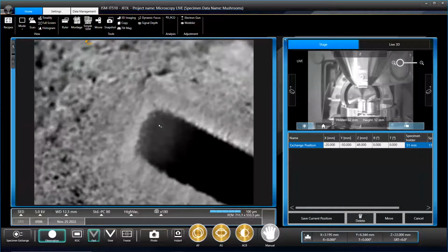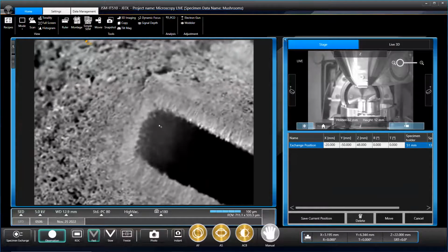Will that begin to focus? You're using the focus dial at the moment. If you turn the dial so that it focuses more, you can then zoom in using the magnification. Okay, so get focus as I want it.